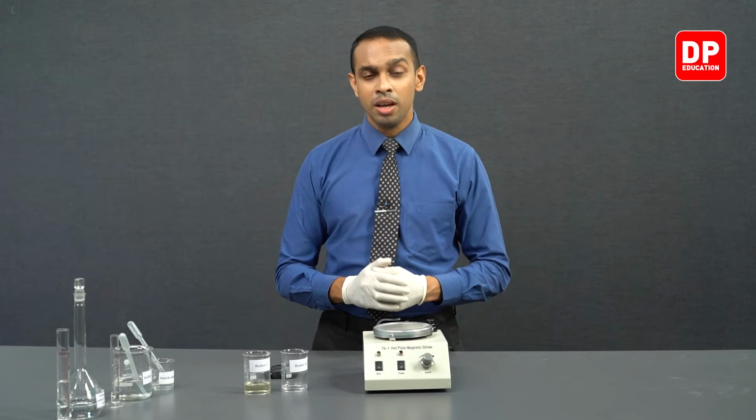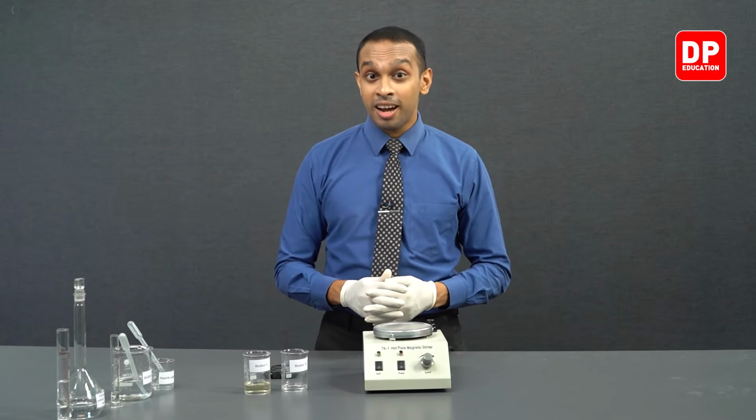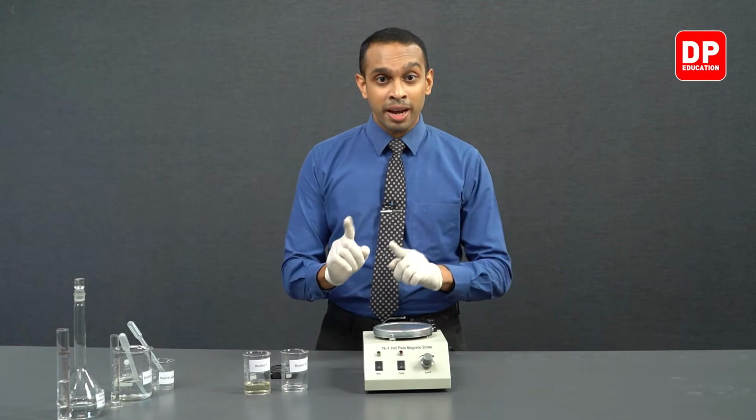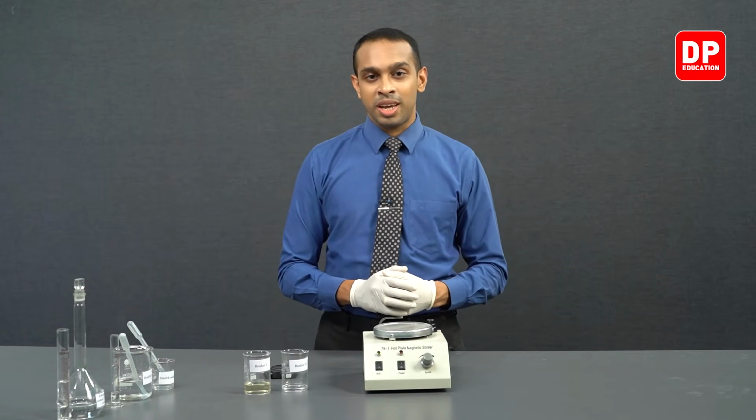So now in this second part of our experiment, we are going to be observing how changing the I minus, or iodide ion, concentration affects the rate of the reaction.